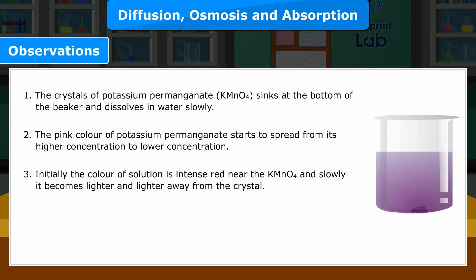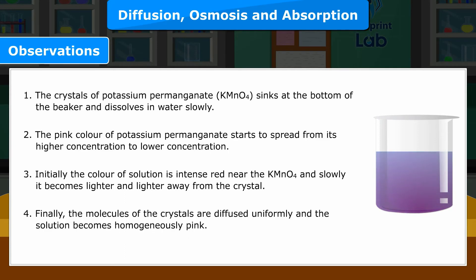3. Initially, the color of the solution is intense red near the KMnO4 and slowly it becomes lighter and lighter away from the crystal. 4. Finally, the molecules of the crystals are diffused uniformly and the solution becomes homogeneously pink.